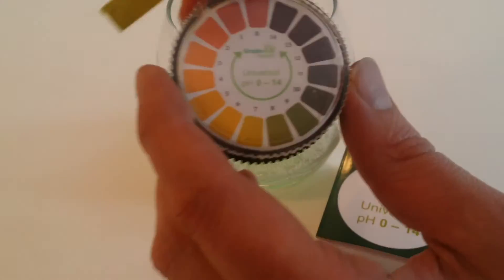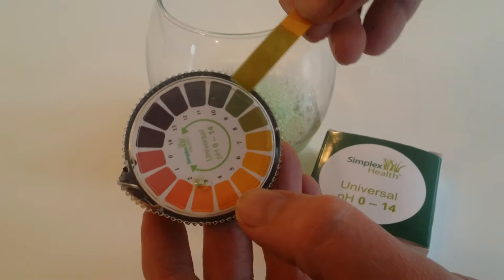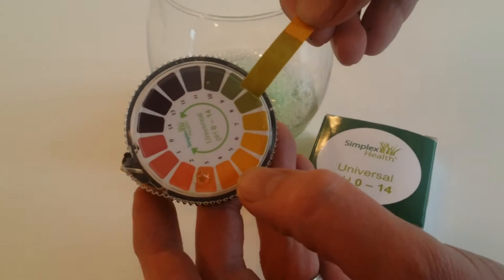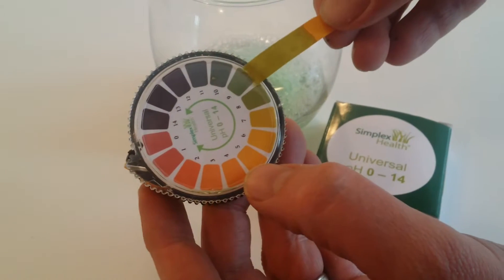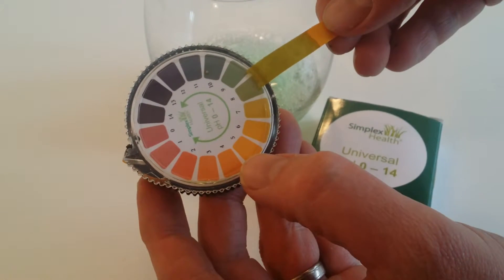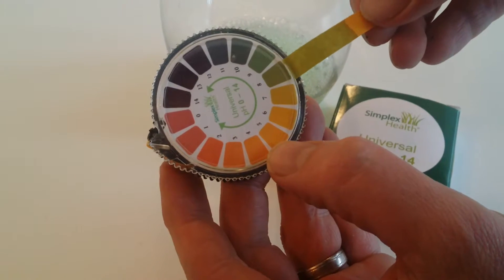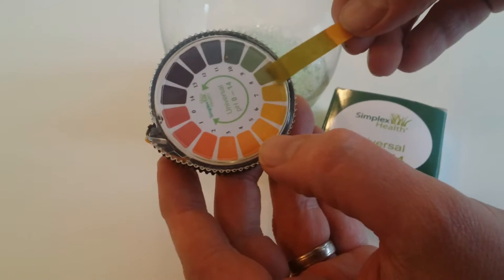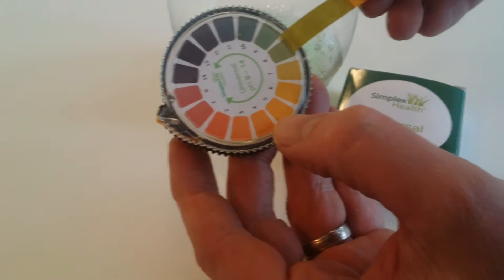Take your litmus paper and then match it to the chart, which we'll do here. So 7 — it's a bit darker than 7. You're looking at here about a pH of 8. Obviously if it's slightly darker or slightly lighter than one of the pads it means it's either slightly above or slightly below that particular pH.